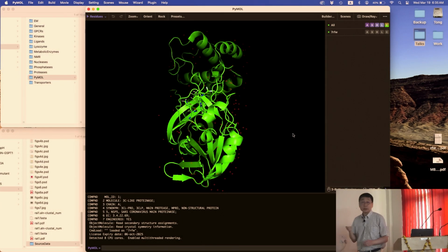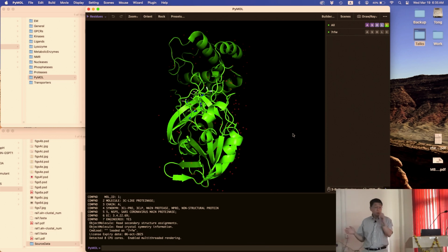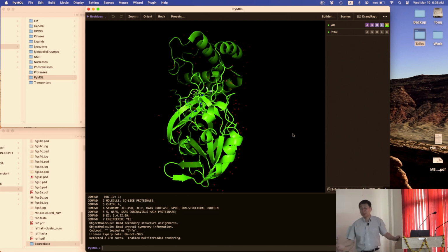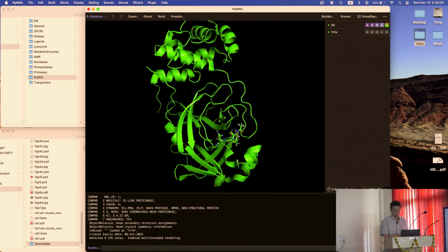Okay. So what do we do? How many of you are familiar with PyMOL? Reasonably familiar, let's say. A reasonable number. So I guess we have to start from the beginning. Yes, sir. Somewhat from the beginning.